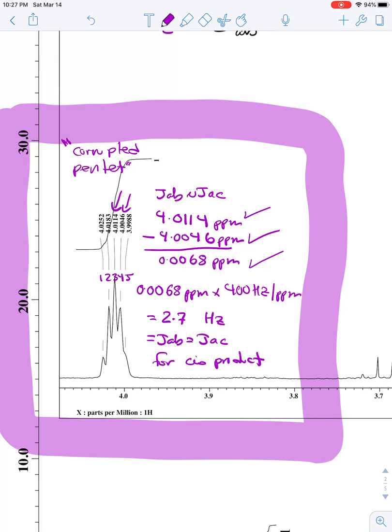Doing that multiplication gives us a value of 2.7 hertz. Again, that's for JAB equaling about equal to JAC. And so that's the value you would report for that.